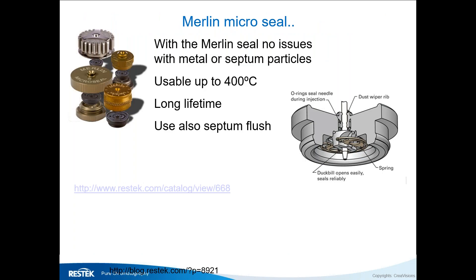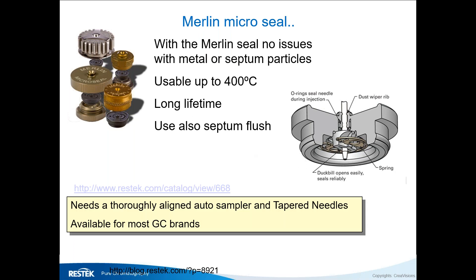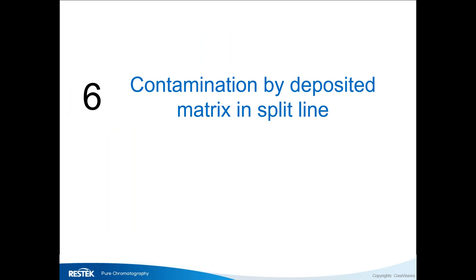Plan B is to eliminate the septum entirely. The Merlin Microseal has been available for many years and can be purchased for older GC brands. It's very stable with a long lifetime, and when used with a septum purge, you can continue using it even when it starts leaking slightly — the purge flow takes away any air that passes through. It is more expensive than a septum. Make sure you use a tapered needle, entering the seal in the center, to maximize its lifetime.